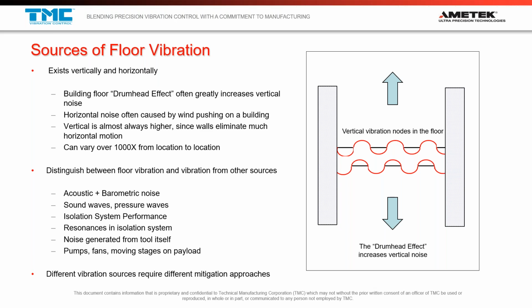And that's also important, because you need to be thinking in 6 degrees of freedom, because an instrument, a microscope placed on a floor, is going to be riding these standing waves, and it's going to be tilting, swaying, rolling and rocking in 6 degrees of freedom. So that's all very, very important when selecting vibration cancellation systems and considering measuring floor vibration.